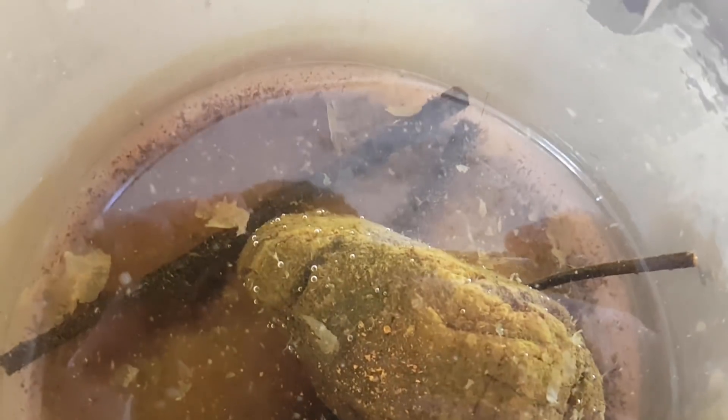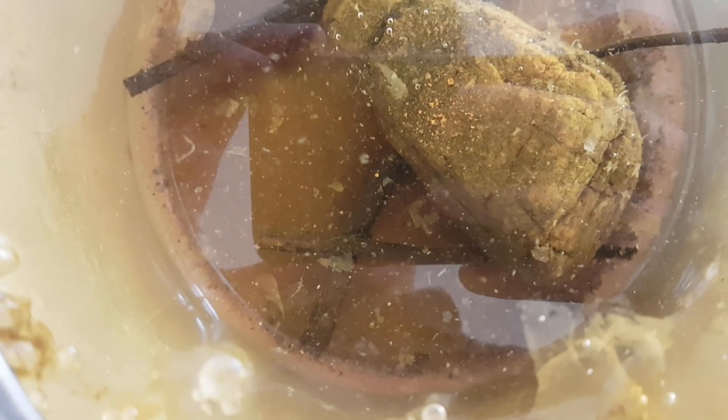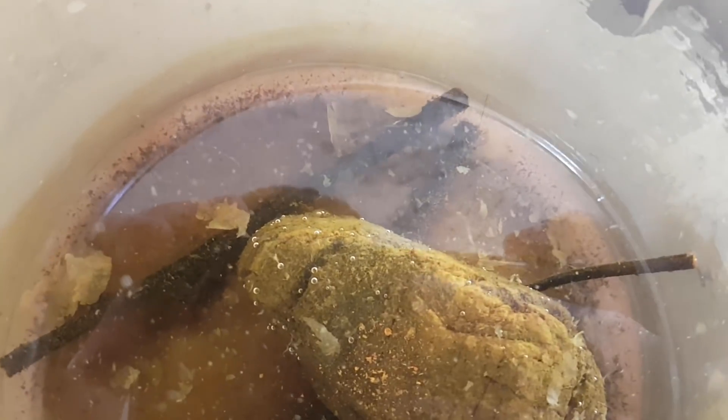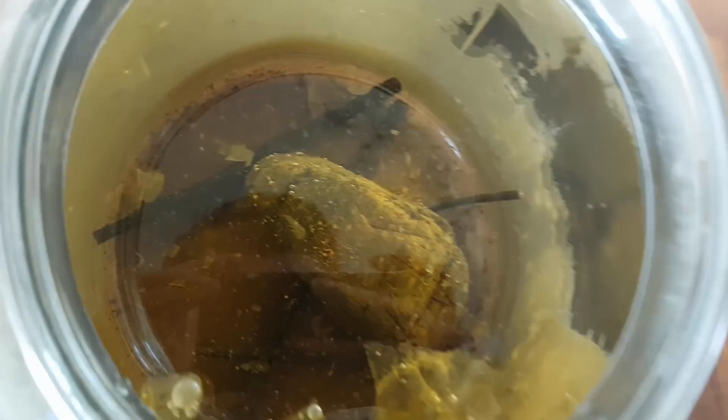I was hoping to find some answers about why the shrimp died, now that I could see inside. But I couldn't see any trace of the shrimp. So it'll remain a mystery.